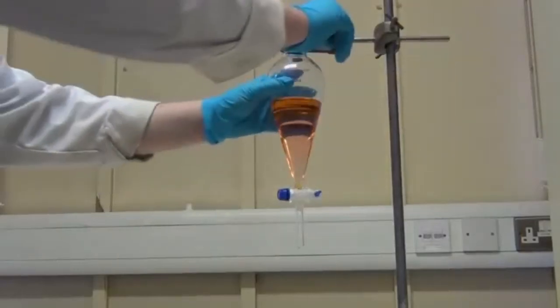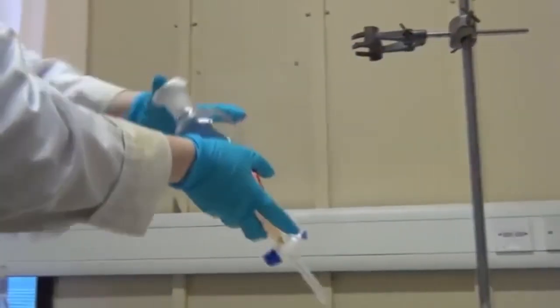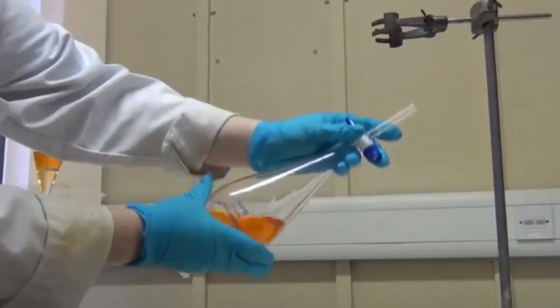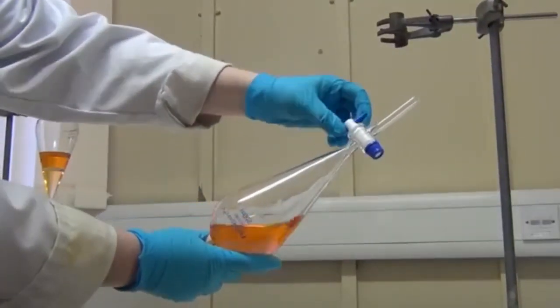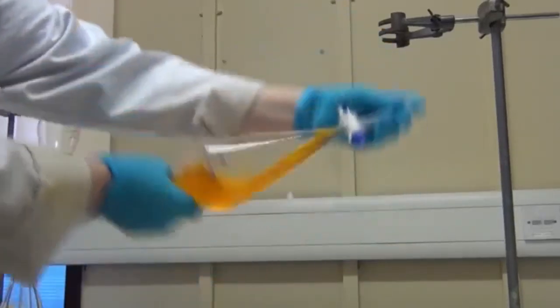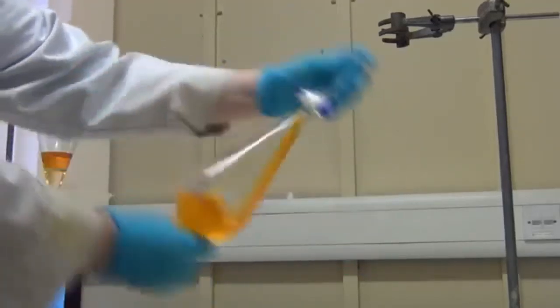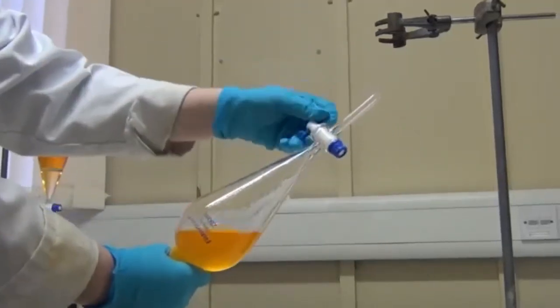In order to carry out an efficient extraction, we must ensure that the organic and aqueous layers are thoroughly mixed. We do this by inverting the funnel. To begin with, you should remove the funnel from the clamp or ring, holding it securely with both hands, and then turn the funnel upside down. When upside down, open the tap to release the pressure that may have built up during the mixing.